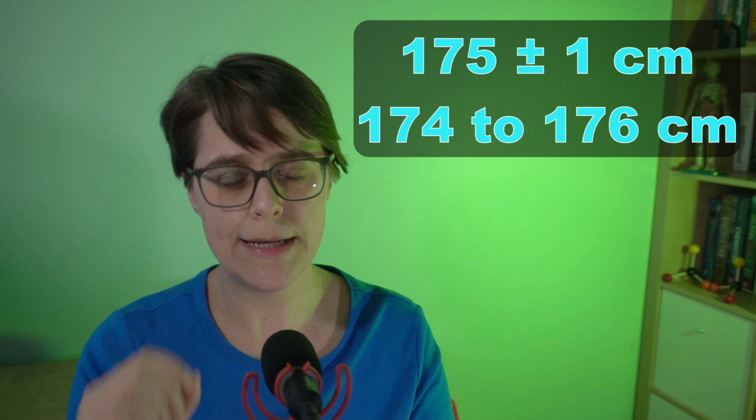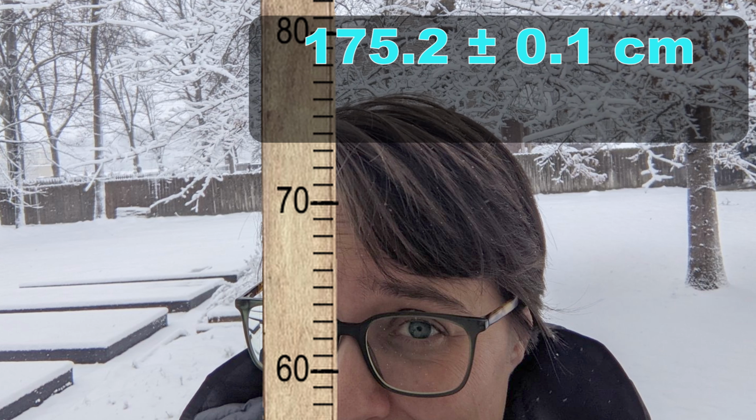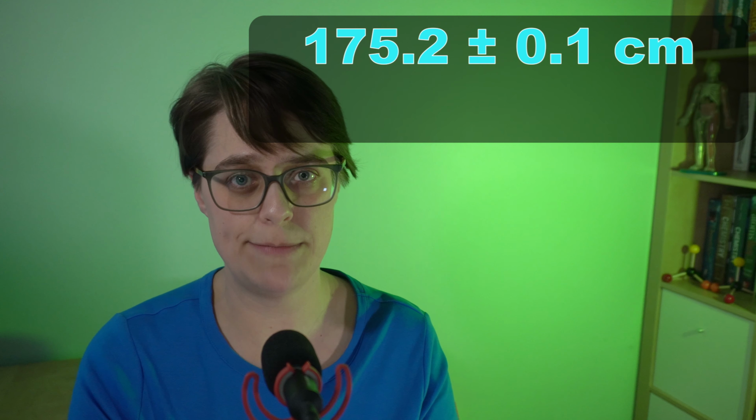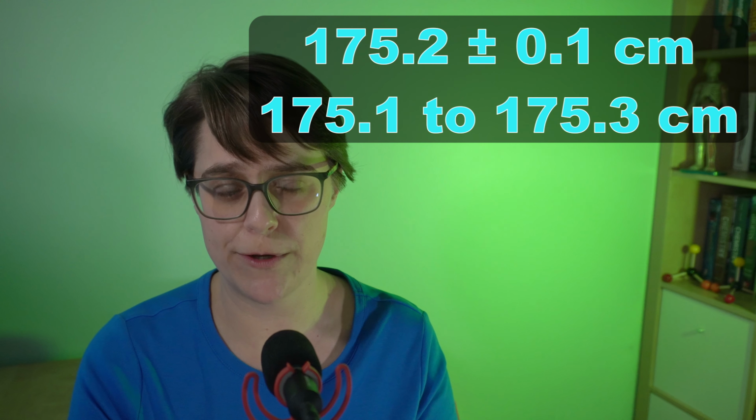Now let's measure this same height again, but with a meter stick that has a line every centimeter. We can see that the height is just a little bit over 175 centimeters. But the rule about uncertainty is the same. Estimate one more digit than there are gradations. So I'm going to record 175.2 plus or minus 0.1 centimeters. This means that the true value is 175.1 to 175.3 centimeters.